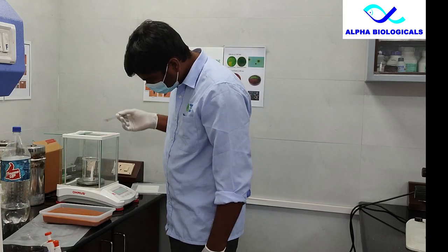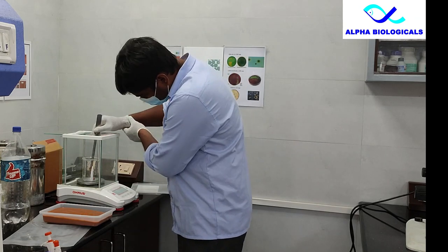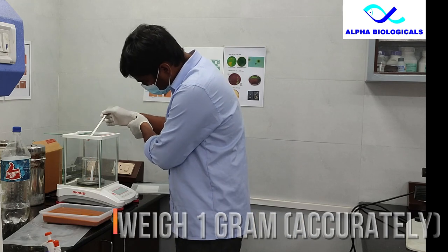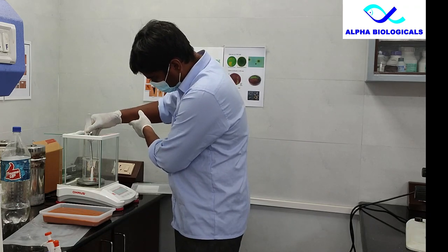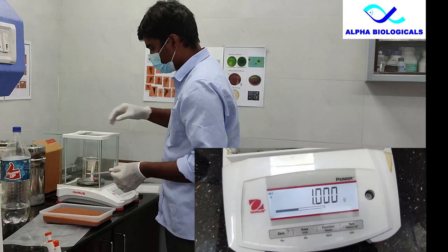Counting artemia nauplii. Exactly weigh 1 gram of artemia nauplii collected in a glass beaker. For this you need a sensitive weighing balance.